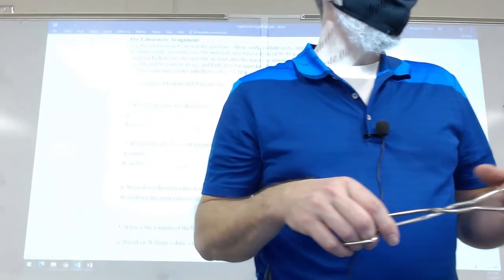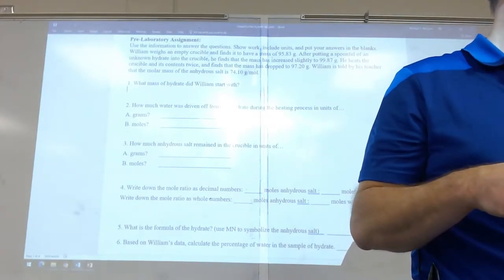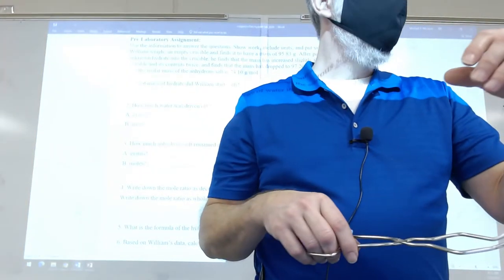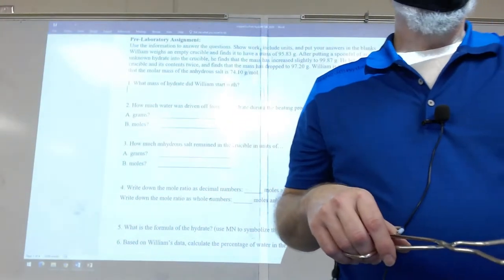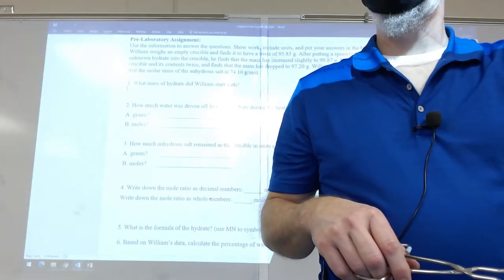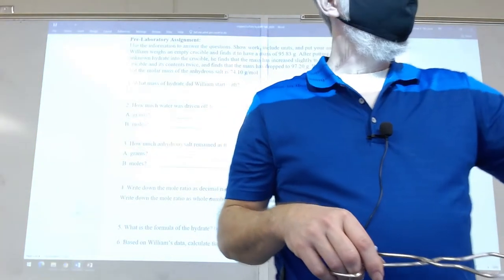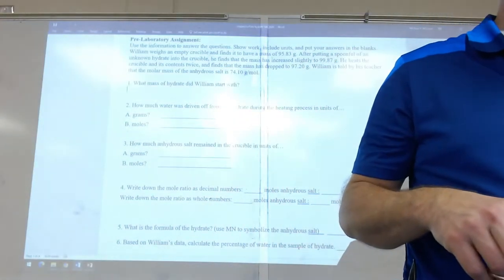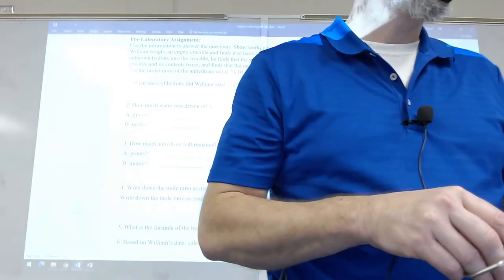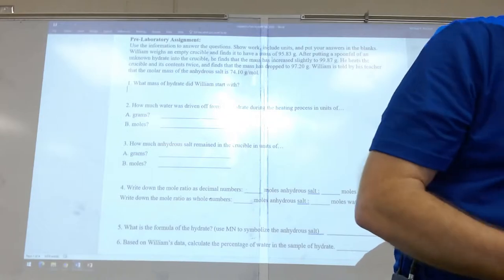We're also going to have a Bunsen burner underneath it with a gentle flame. So that means all blue, but we're not going to have the what? We're not going to have the inner cone. We're going to keep it turned down. We're going to have some space between it. Don't let it go yellow. Okay, but I want it all blue, and there's going to be a gap between the two. We're going to do some gentle heating, and I'll go over that again next class. All right, just to be clear. All right, so here's what William's going to do.